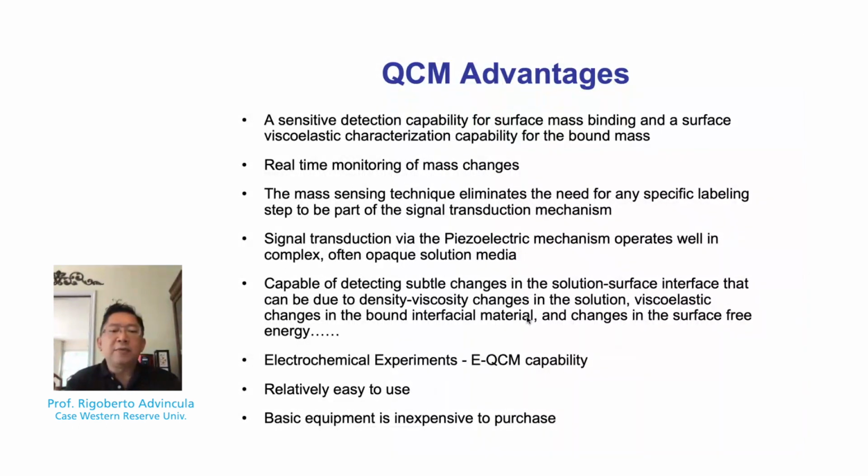One of the interesting tandem, simultaneous, or real-time measurements could be the combination of electrochemistry and QCM. As you can see, with electrochemistry, one can monitor the deposition or even desorption of redox active material, including metals, organic molecules, and polymers, which can then be related directly to the mass change as the deposition or desorption occurs.